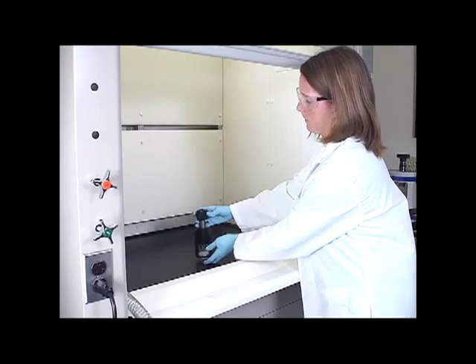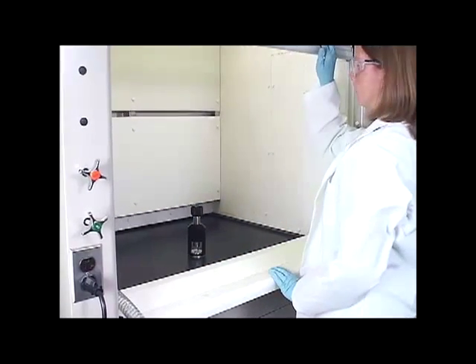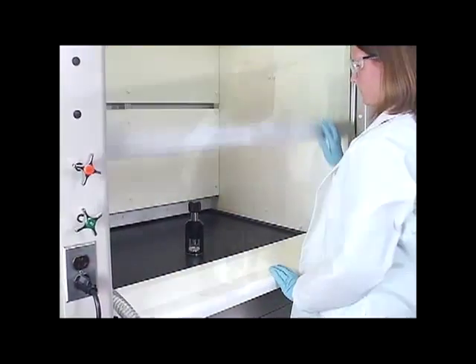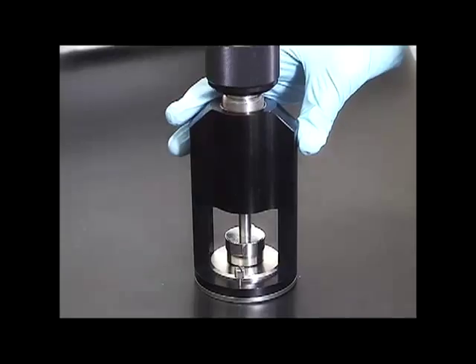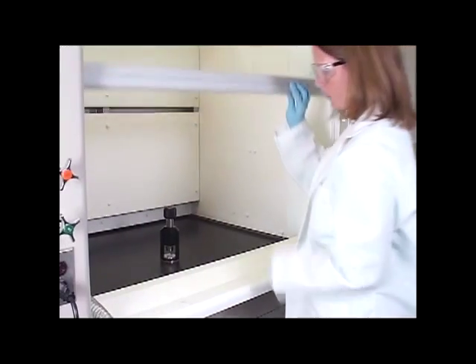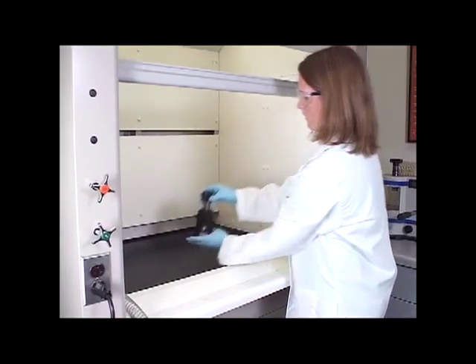The detachable environmental chamber, for safe containment of hazardous matter, allows the sample to be loaded in a fume hood or glove box.